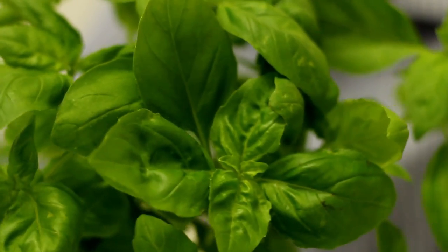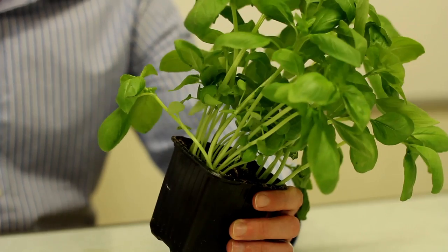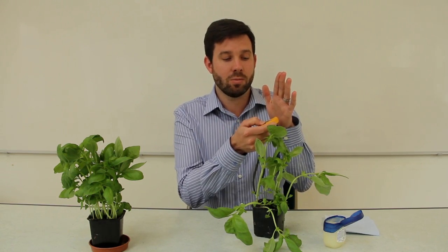We're looking at the transpiration stream at post-16 level, and what we're doing is using these devices called infrared thermometers. They're about £17 each and you can use them to measure the surface temperature of a surface — my palm, for example, is 30.1 degrees.